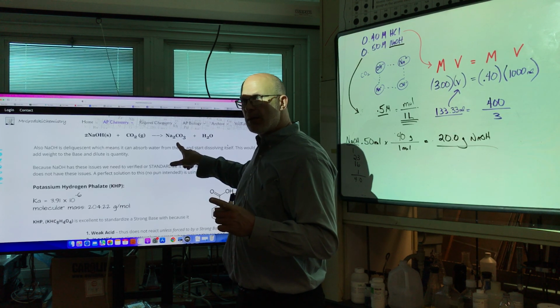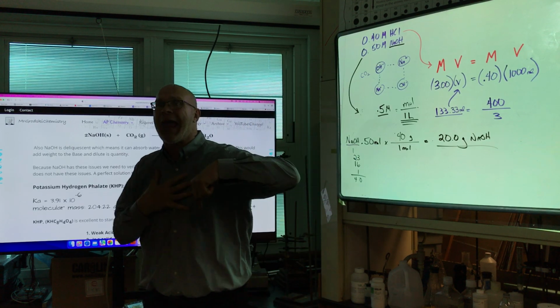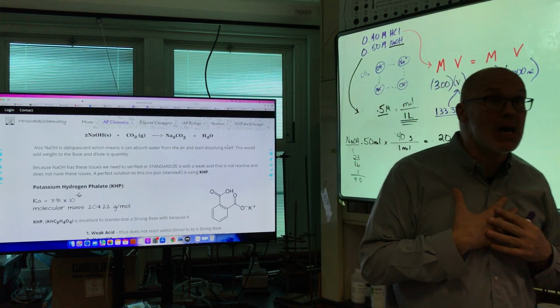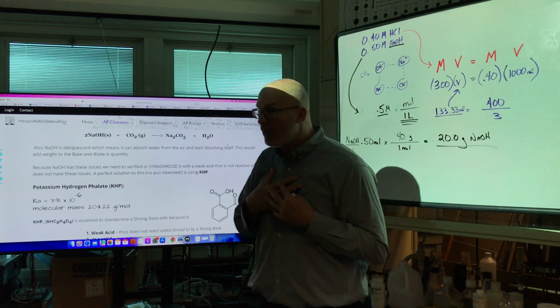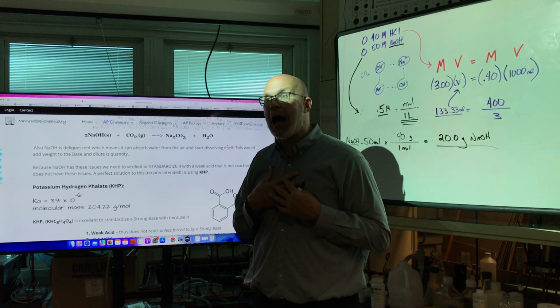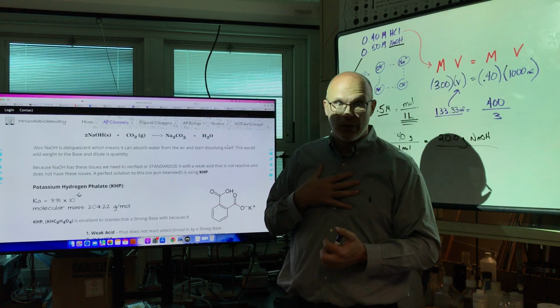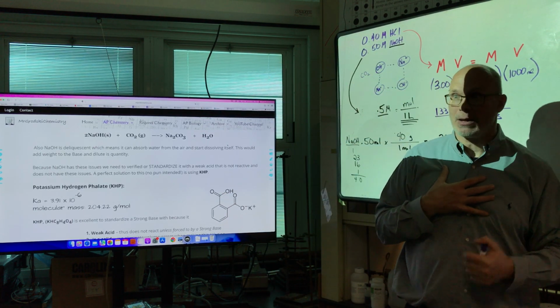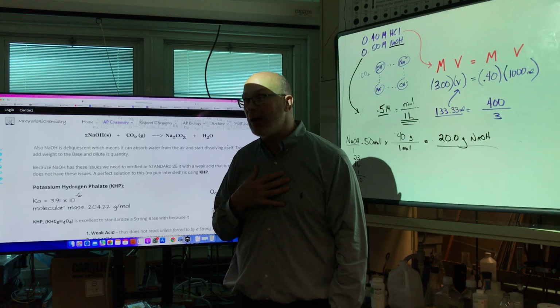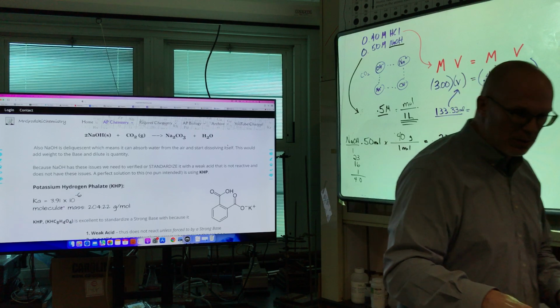Yet the amount of hydroxide, what? Goes down. So I can't help it. Don't blame me. I tried to make 0.5 molar NaOH, but it's not. No matter how much time I spent in here, sleeping over here last night, measuring, hoping this came out, it just didn't come out to 0.5. You know why? Because it reacts in the air. It gets diluted and something else happens to it.